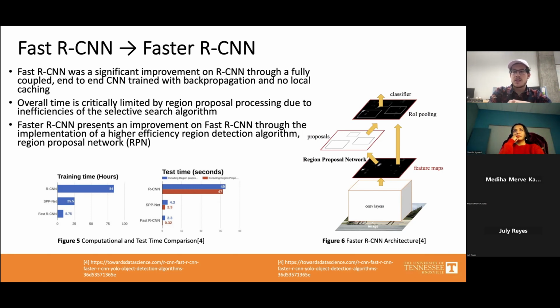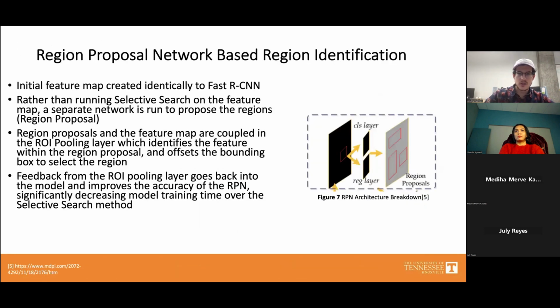And then at the same time, from that feature map, you're using a trained neural network to isolate region proposal boxes, as well as having the features. Those are passed into the next layer called the region of interest pooling layer. And that is where your regions of interest are basically applied to the features, as well as the feature classification process.